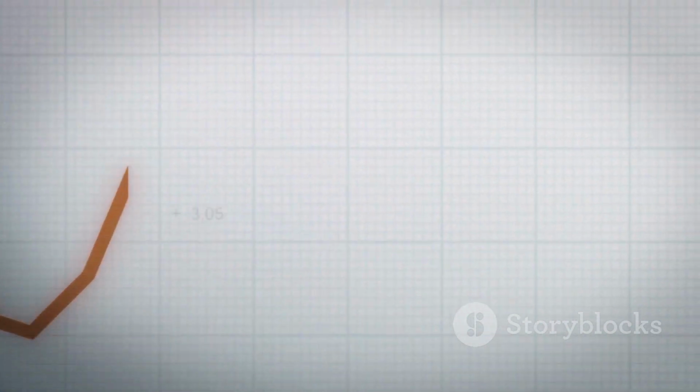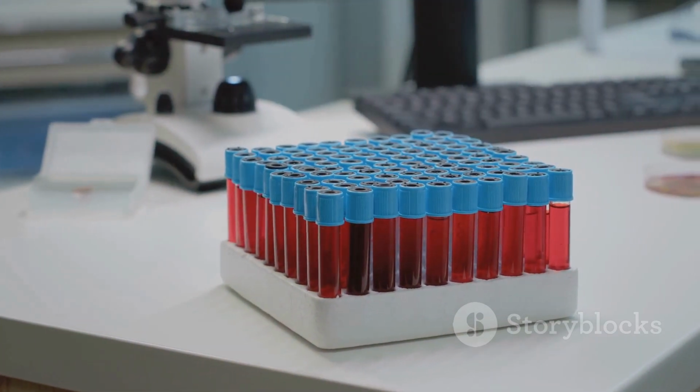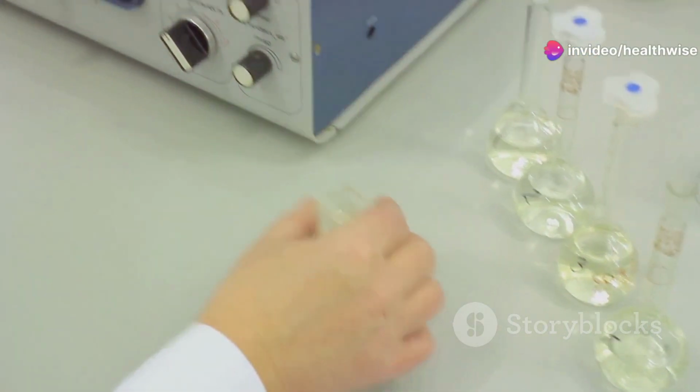Calibration curves are essential tools in analytical chemistry. They help us determine the concentration of an unknown sample by plotting the instrument's response against known standards. Let's dive in. First, let's talk about the reagents you'll need.